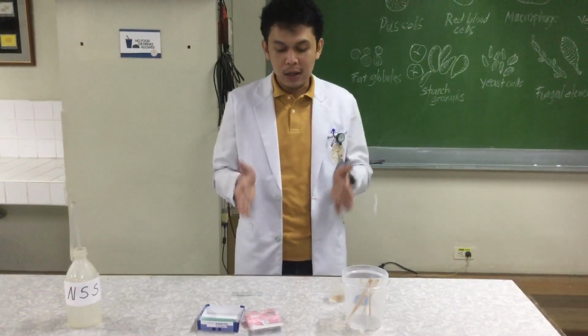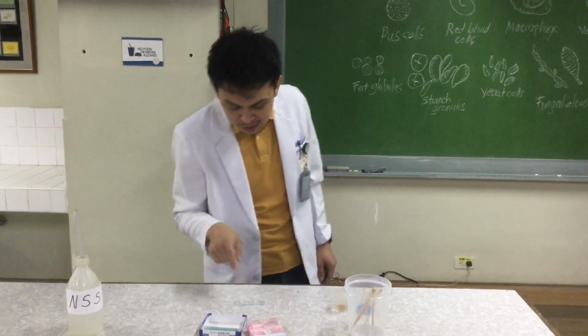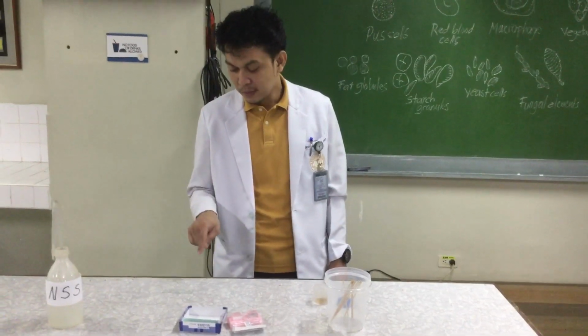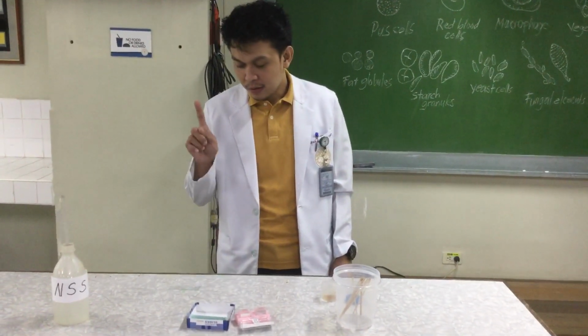Because if you will immediately examine it, you will notice that there is a huge movement of materials inside. So, allow it to settle for about 1 to 2 minutes before you examine it under the microscope. Okay? So, that's how you prepare the fecal smear or the direct fecal smear preparation. Okay?